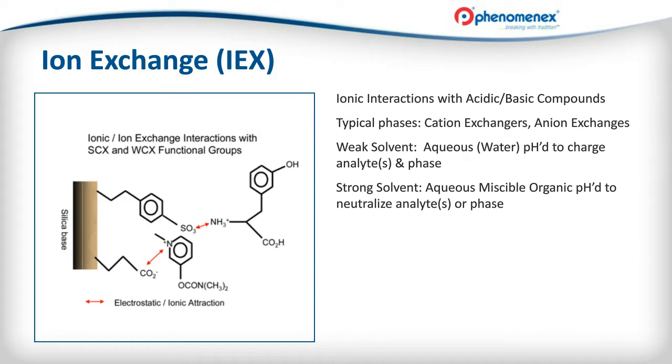So ion exchange. I'm going to be talking a lot about ion exchange SPE today, and specifically stated that I think it is the best form of SPE. It is the strongest interaction. It's actually a Coulombic force attraction, so it requires substantially more energy to break this bond than it does for a weaker reverse phase or even dipole-dipole interaction.